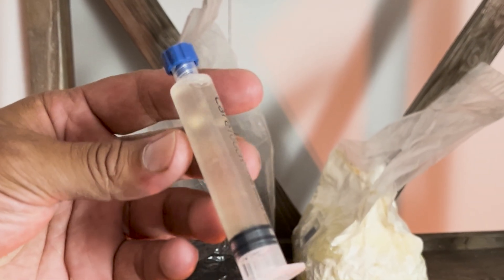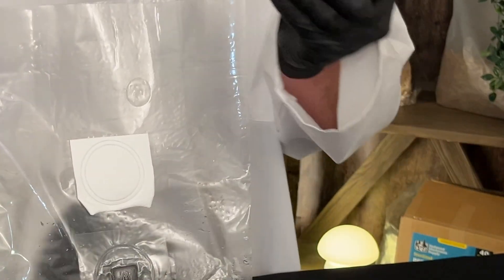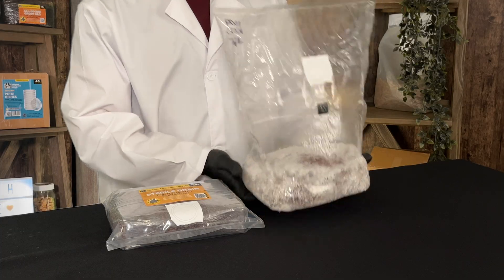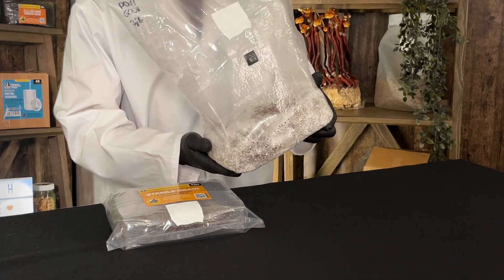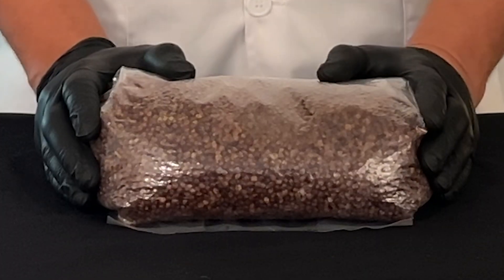Mushroom cultivation begins with a tiny organism — either a small amount of mushroom mycelium mixed in a nutrient-rich solution, aka a liquid culture, or a small piece of mycelium from an agar plate, aka plate culture. For most mushrooms, it starts with grain spawn. Sterilized grain, which typically comes in bags, is how we expand our culture into spawn. It's packed with moisture and nutrients to provide an all-you-can-eat buffet for our mycelium, and since it's sterilized, you don't have to worry about contamination.